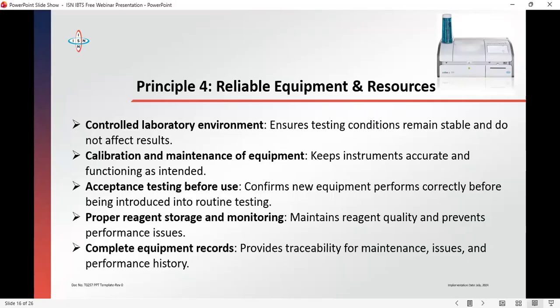You need to engage in an external proficiency testing that tests the accuracy of your results. Are you subscribing to this? Because all these are to ensure that all the tools that you use are producing accurate results that will not cause harm to the patient.